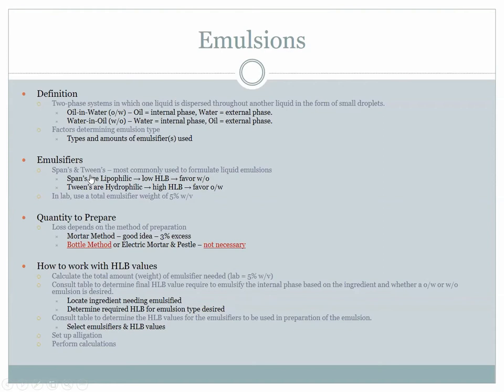And so what you're going to see here, making these things is a piece of cake, but the calculations and the formulation take a little bit of time so that you can get the right types and the right amounts of your emulsifiers to get the actual type of emulsion that you want. All right, enough of that.